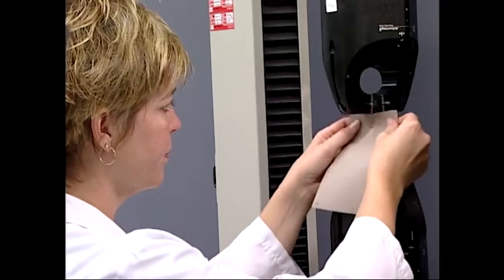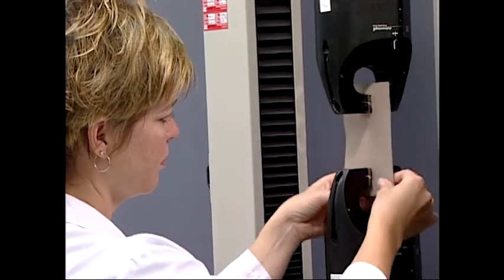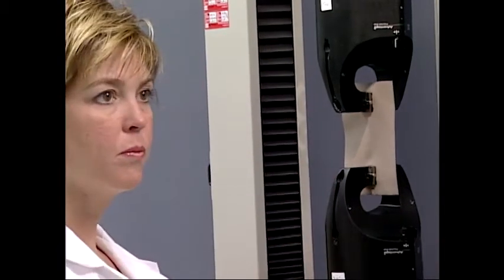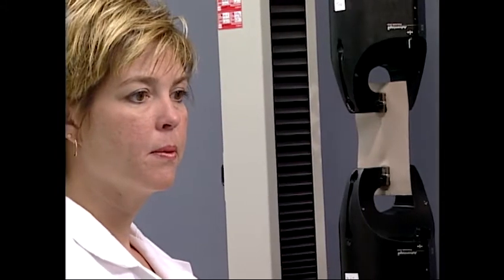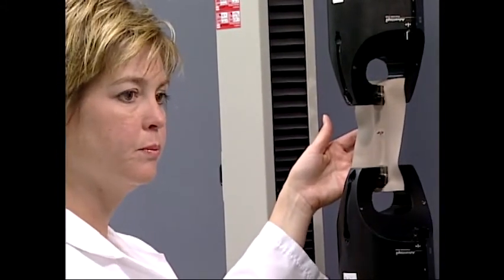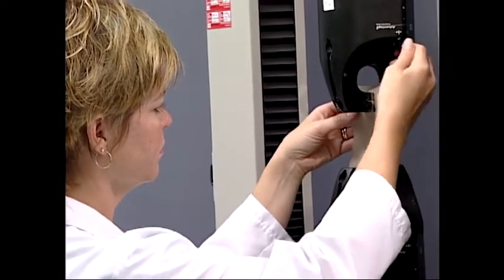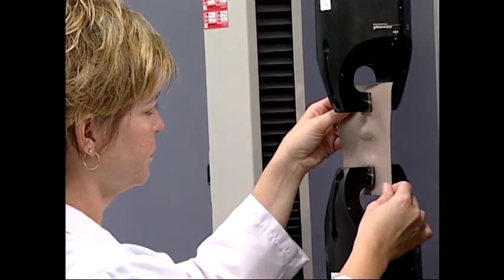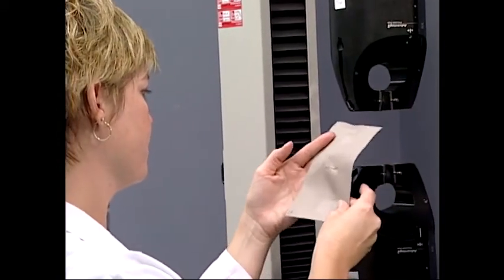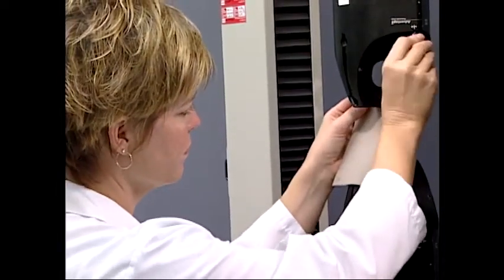One form of tensile testing for woven fabrics is the grab test. This test method is ASTM D5034, Breaking Strength and Elongation of Textile Fabrics, grab test. This specific test uses specimens that are wider than the jaws or clamps on the tester. This test is used primarily to measure breaking strength on rigid fabrics such as wovens, non-wovens, felted fabrics, and some special warp knits. Weft knitted fabrics have too high an elongation for testing on the grab test.